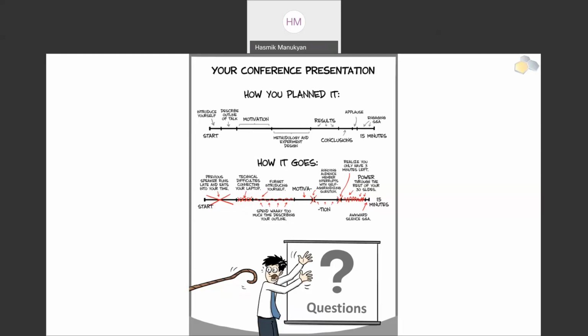But given the fact that we have both regulatory and scientific instances, I think we can easily accommodate your needs. But registering to Hive should be the easy first step that you can do. I will also try to post the link here and some answers to this question, if it's possible. And I hope that will answer all of your related questions as to how to register into Hive. Yes, and we are always looking for collaborations.